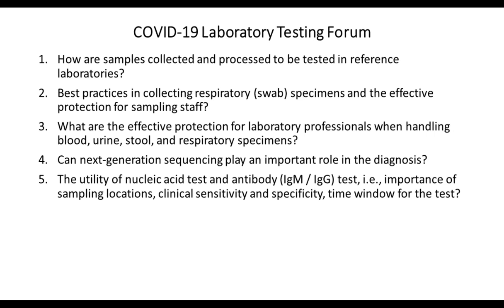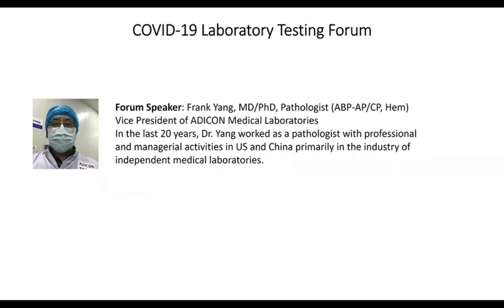A level 2 laboratory or P2 laboratory is adequate to handle COVID-19, according to authorities as well as experts. But we raise the personal protection to level 3. This includes an N95 face mask, goggles, face shields, double gloves, hat, disposable protective clothes, and shoe covers. The tests were conducted in certified PCR labs that are designed to minimize nucleic acid contamination.